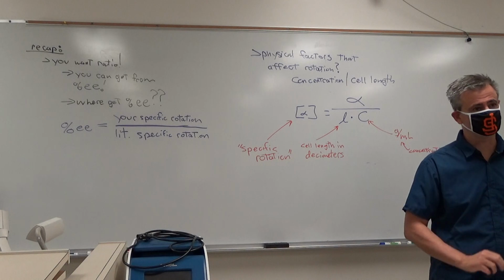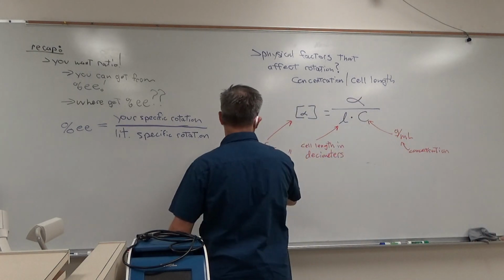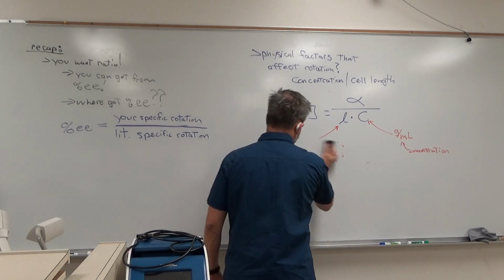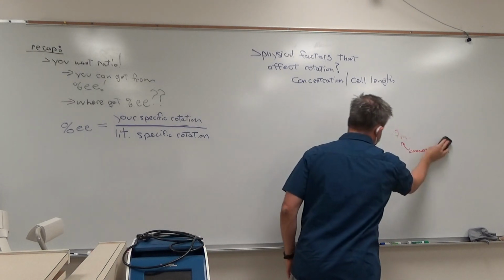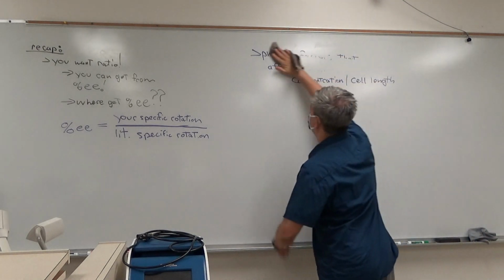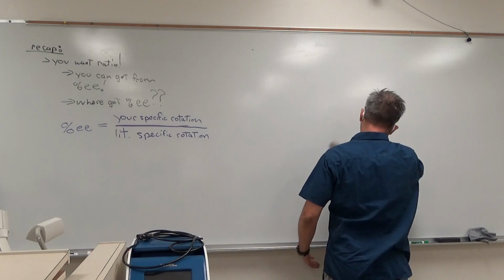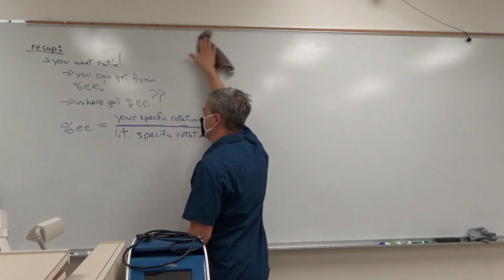And that's where we're going to use NMR. The whole purpose of using NMR is to figure out the mass percent: how much of that 200 milligrams, or whatever you end up getting, is product. You might have 127 milligrams or something like that. I don't know.